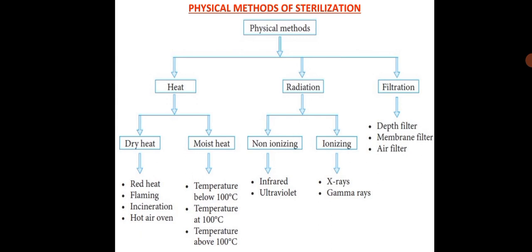Let's start with the physical method of sterilization that is achieved through heat. Heat is employed either as dry heat or moist heat. In the coming slides, you will get to learn about each method employing heat as a means of sterilization.